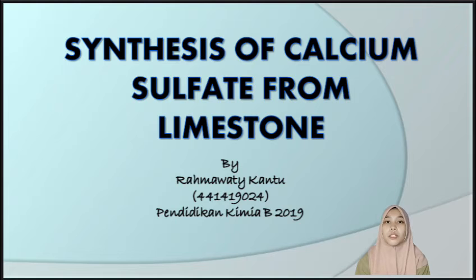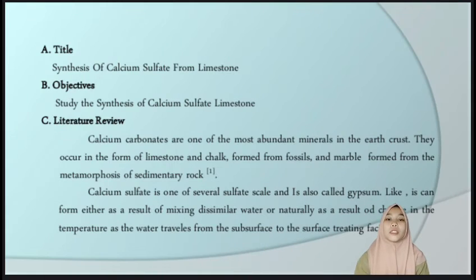I am from Chemistry Education Class B. I will explain the practicum about the synthesis of calcium sulfate from limestone. The objective: to study the synthesis of calcium sulfate from limestone.